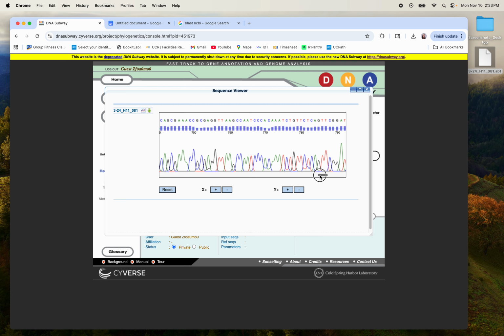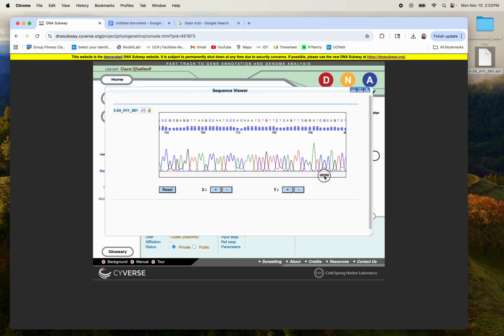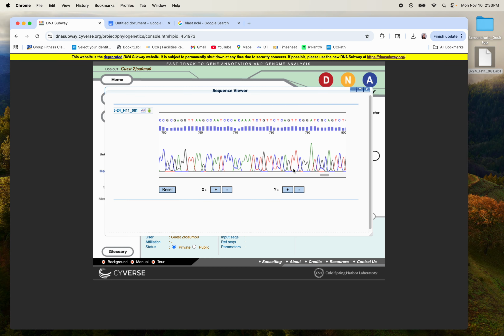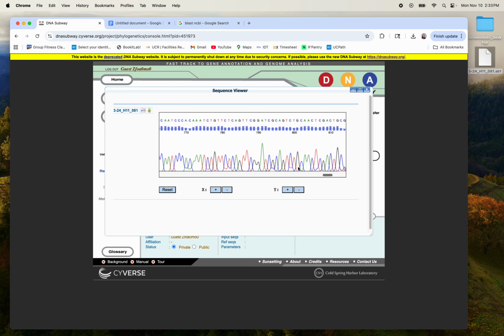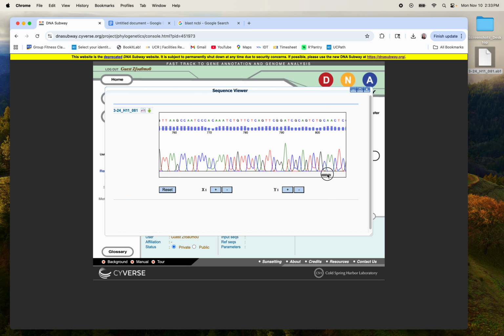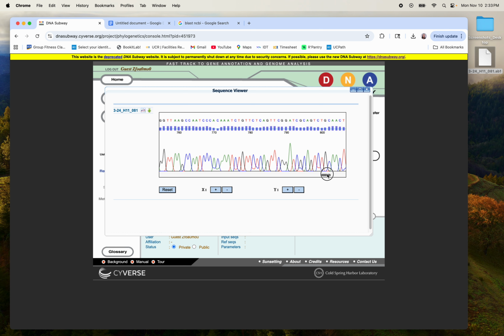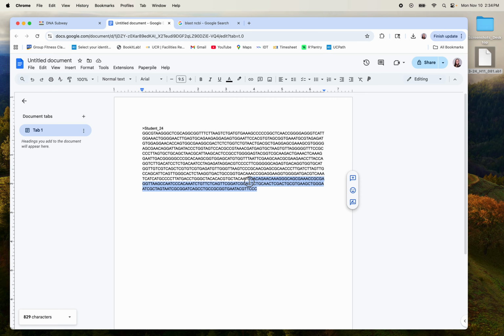And we should probably cut it around probably 770, maybe 780, where you can start to see there's not too much overlap. But definitely by 790, things are starting to have extra peaks. So maybe for this one, we'll cut off at about the 780 mark. Okay, so 780, 870, so we want to cut off 90 from the end.